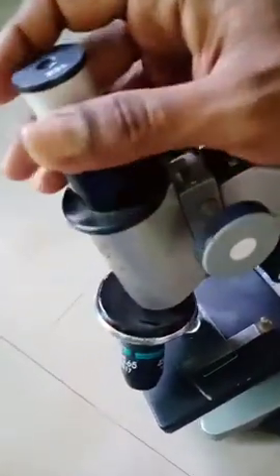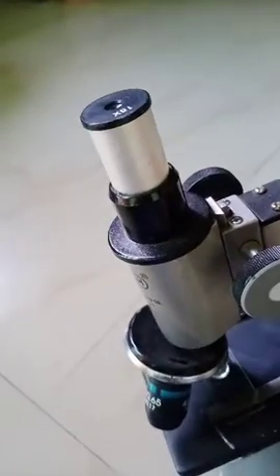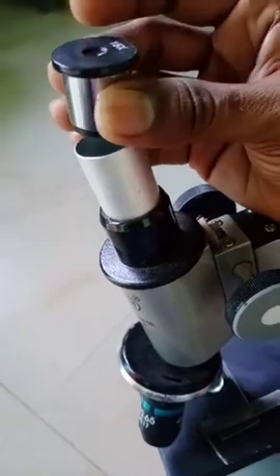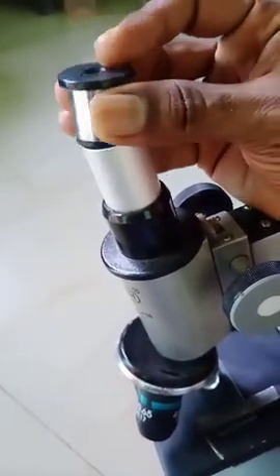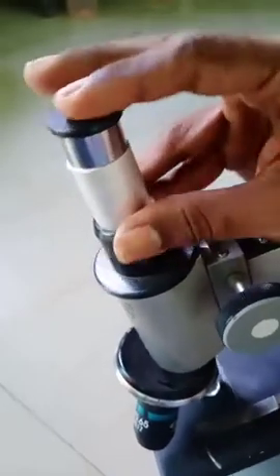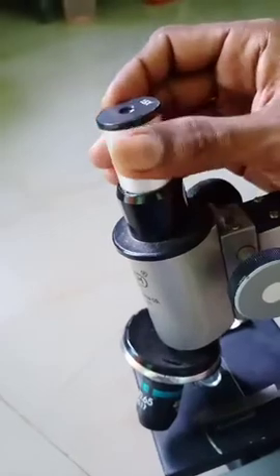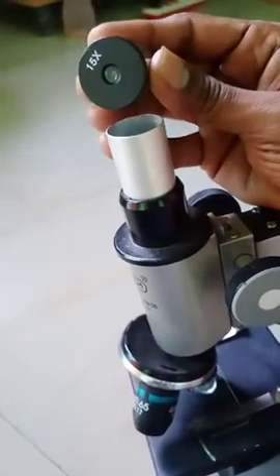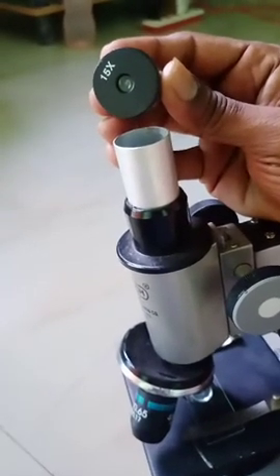Here we have one more part of the microscope. This is called the eye lens. This eye lens is fixed in the eyepiece. This is called the eyepiece. This eye lens may be 15x, 10x, 20x, 40x, 50x, 100x, more than 100x also.